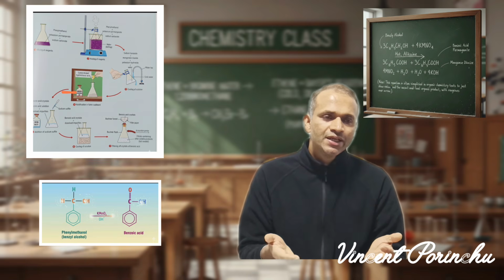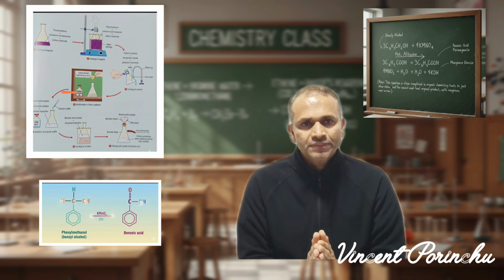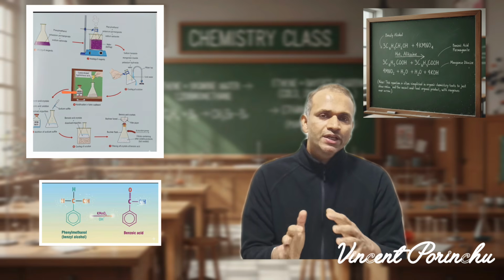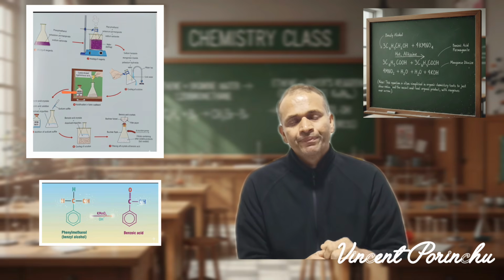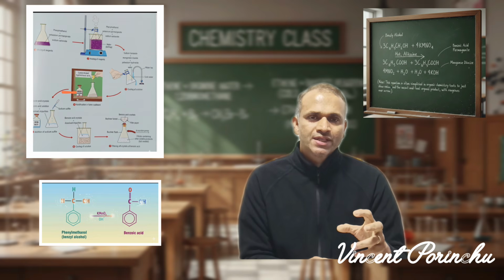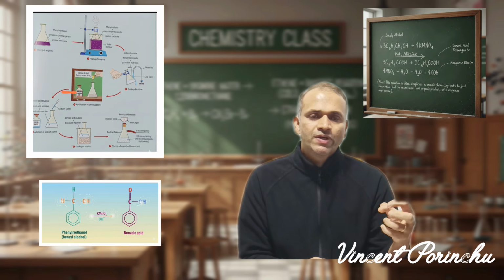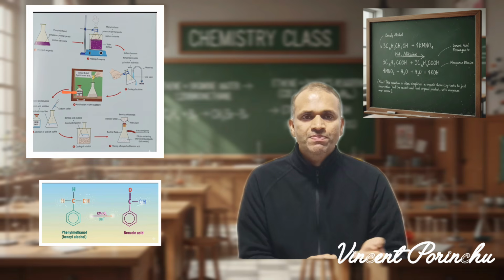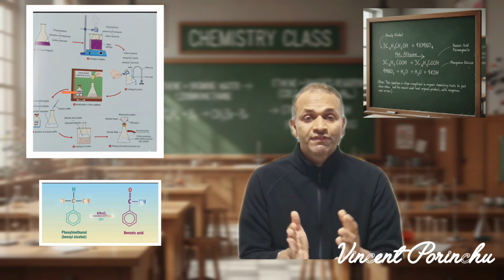So we have to separate that using a special device called a Buchner funnel and Buchner flask. We filter this mixture using the Buchner flask attached with the Buchner funnel. This is a filtration device under vacuum condition. We put some extra vacuum to enhance the speed of filtration. Otherwise it will take days to get the filtration completed.